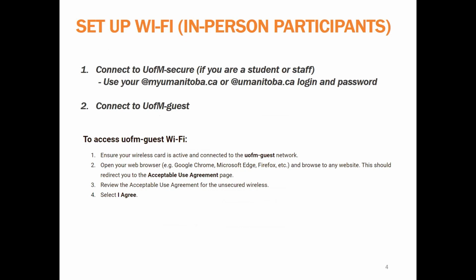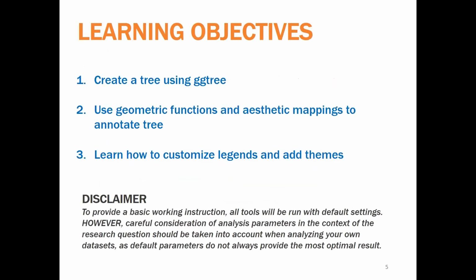So our learning objectives for today's workshop is to create a tree using ggtree. We'll use geometric functions and aesthetic mappings to annotate the tree. And then we'll learn how to customize legends and add themes.